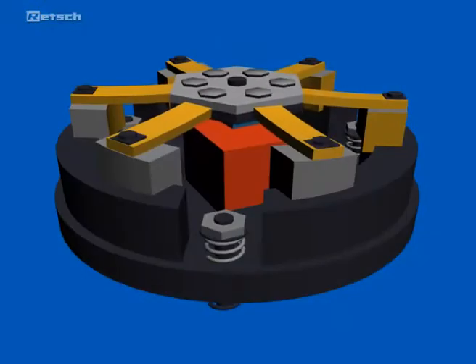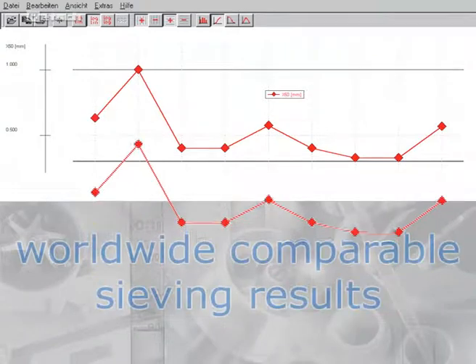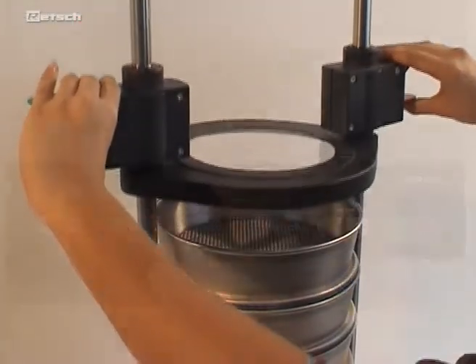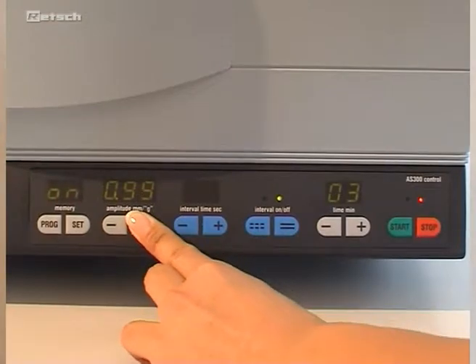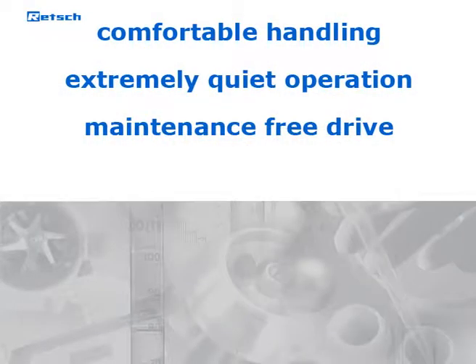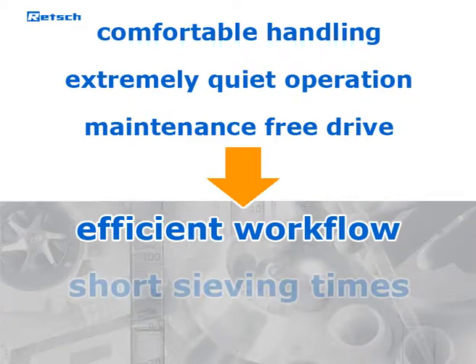The superior drive mechanism, as well as the sieve acceleration, which can be set independently of the power frequency, ensure comparable and reproducible sieving results worldwide. Comfortable handling, digital parameter adjustment, and an extremely quiet and maintenance-free drive make this device very convenient and user-friendly. All these features guarantee an efficient workflow and short sieving times.